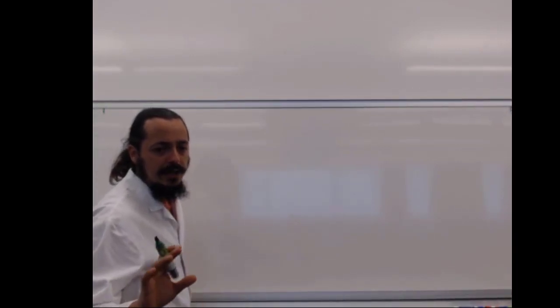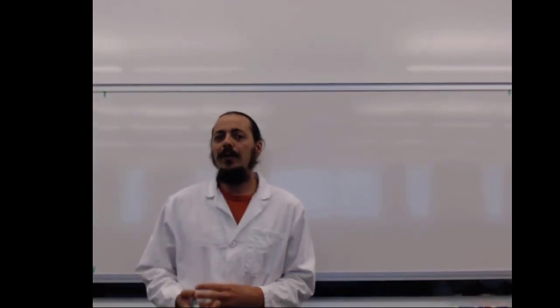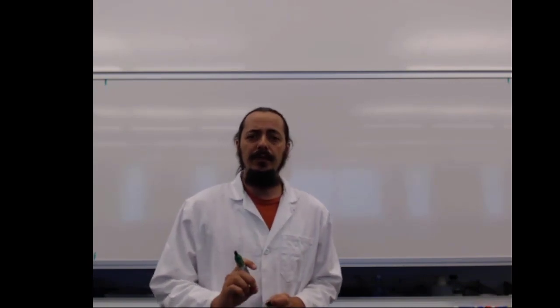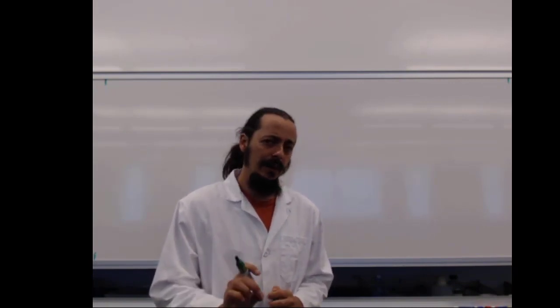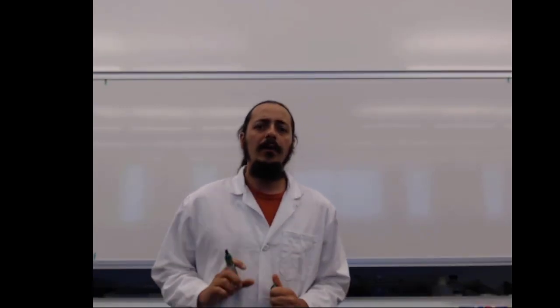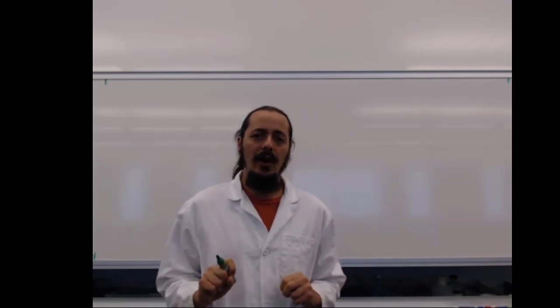This one is in your types of reactions lab. It is reaction number 10. And the reaction is silver nitrate with sodium phosphate. Now the first thing we need to be able to do in order to predict our chemical reaction is we need to be able to determine what chemical compounds we're talking about. And we need to have good chemical compounds.